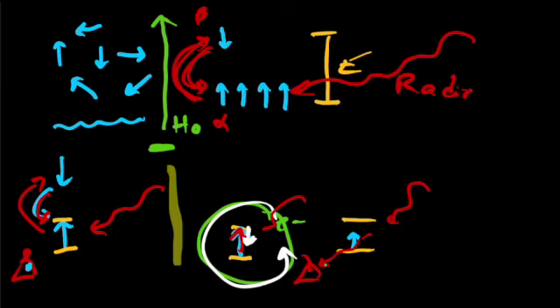We take that little magnet, and remember it's inside of a magnetic field, H naught. We take a little bit more magnet and we add it. So we increase the strength of our magnet. We crank it up and we crank it up. And as we start to crank it up, this gets taller and taller until now the magnet, when it takes on that extra magnetic field, is now the size of my yellow lines.